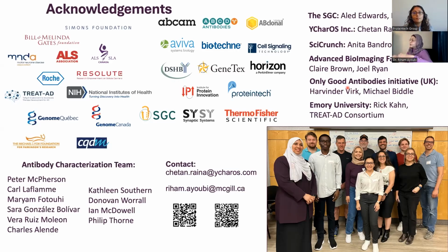However, this is part of it. Another part can be doing some fine tuning and some optimization of your actual blocking steps, because that noise can be eliminated sometimes with that, or using, I don't know if you are using BSA to dilute your primary antibody. Maybe you could switch to milk, which tends to have a little bit more power in blocking noise.